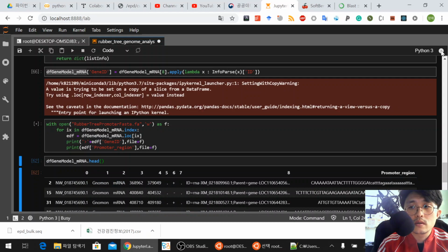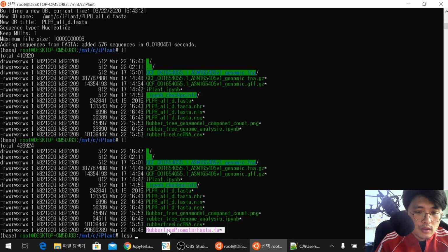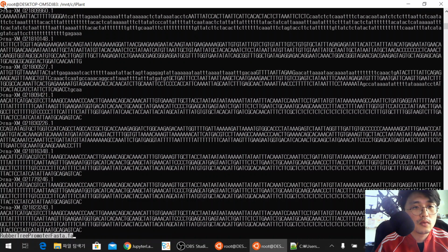Once it is completed, then our directory will have the promoter FASTA. Okay, it is done. Let's go to our directory. Okay, we have it. Let's check if it is well organized. Okay, so we have gene ID, and this is the promoter sequences. So everything is well parsed.